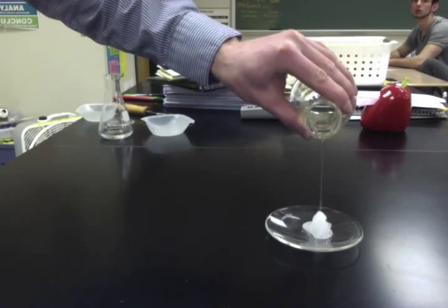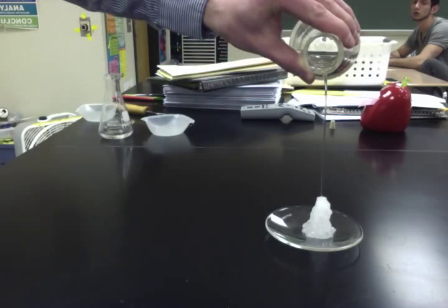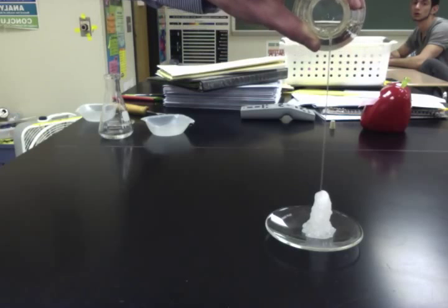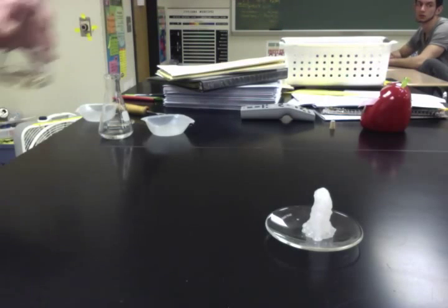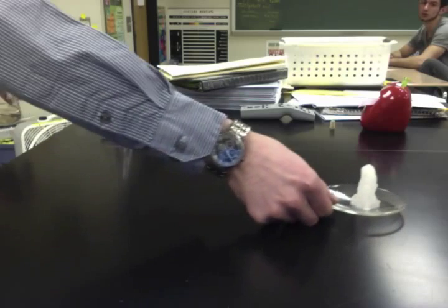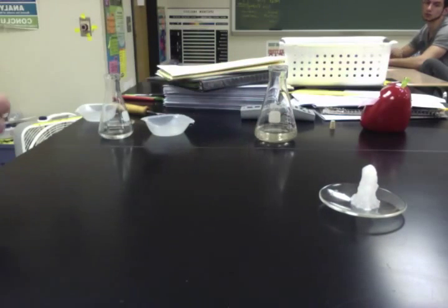And all the solute's coming out of it. And I get a tower of sodium acetate. So at room temperature, this solution can't hold as much of the sodium acetate as I've dissolved in there. I've kind of tricked it into doing that, and that's a supersaturated solution.